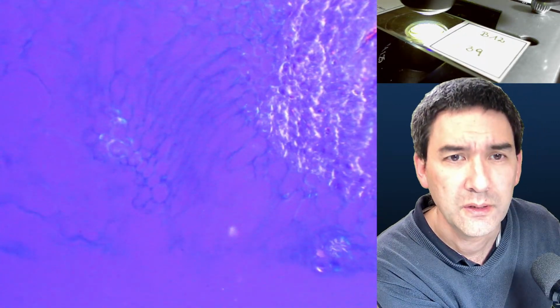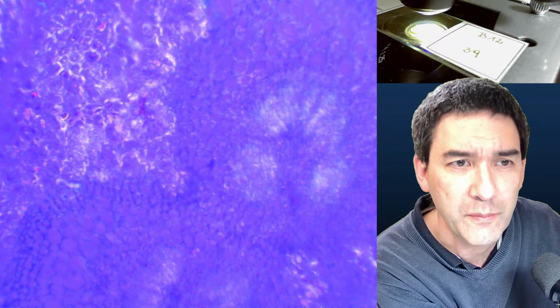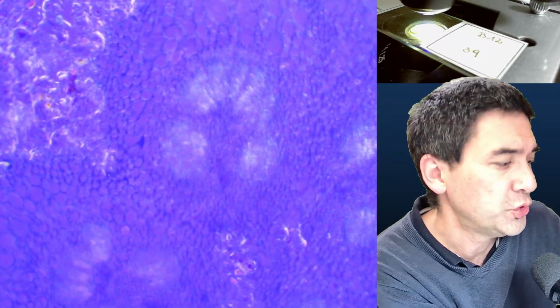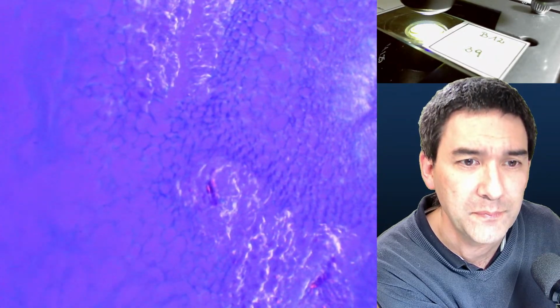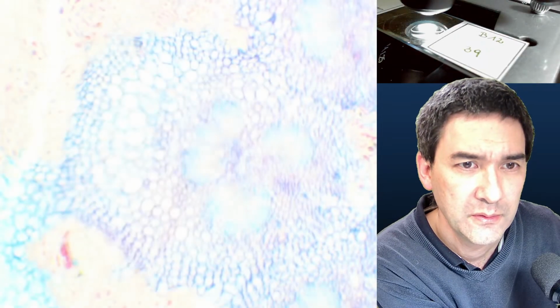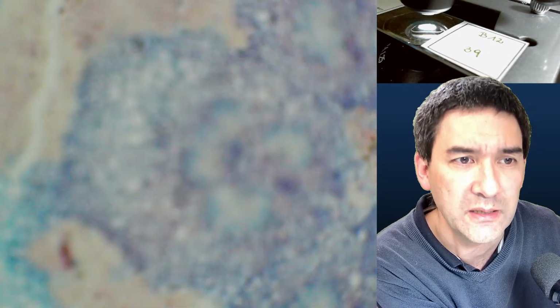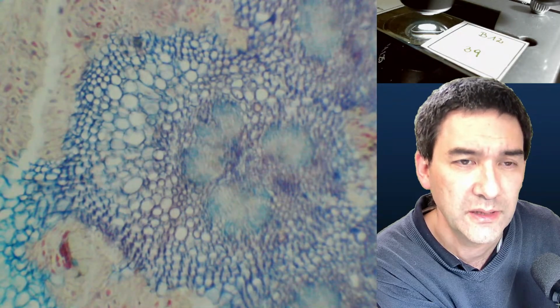And while it does not appear to be so nice looking as the other one, so that is the cross section of a pear, I still want to demonstrate something to you here, because it can be used to differentiate different cell types. So I'm going to give you now an image first of how it looks completely under normal bright field. Okay, so that's basically how the specimen looks in bright field. You can see the cell walls of the cells, right?